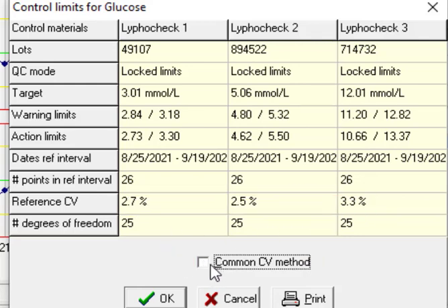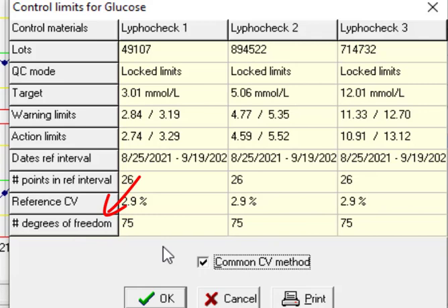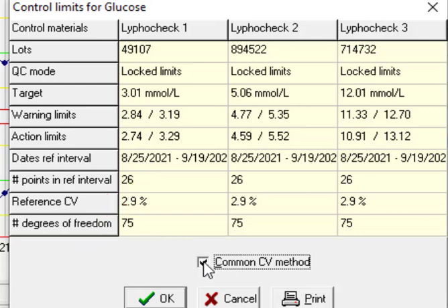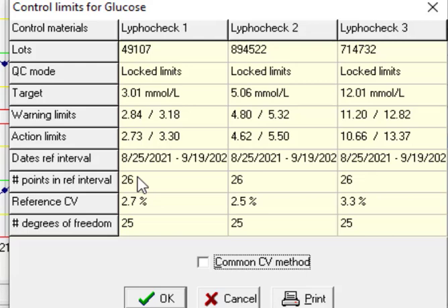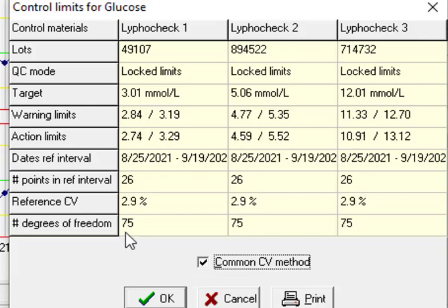Degree of freedom is number of data minus one. You see there are different perspectives. For digital level it's 25 because we have 26 numbers or data and for common CV we have 75.